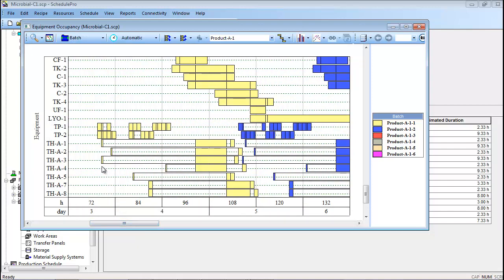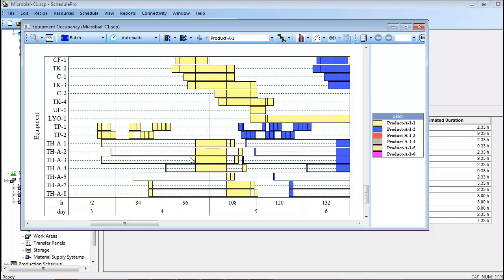Here, it is easier to see one of the receive buffer operations, the idle time shown in white, and the use buffer operation. The reason there is extended idle time between the preparation and use of the buffers is that it is prudent to prepare the buffers well in advance of their planned usage in the process. This ensures that buffer availability does not become a production bottleneck, even if a specific preparation activity takes longer than expected or all buffer prep tanks are already occupied at the scheduled buffer prep procedure's start time.